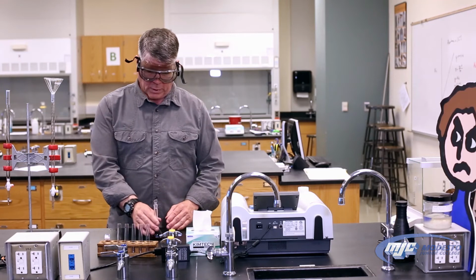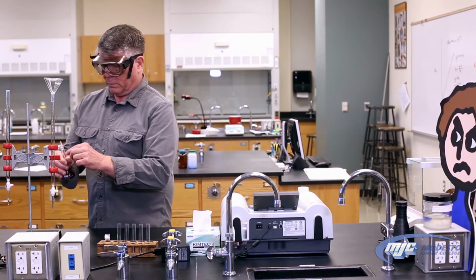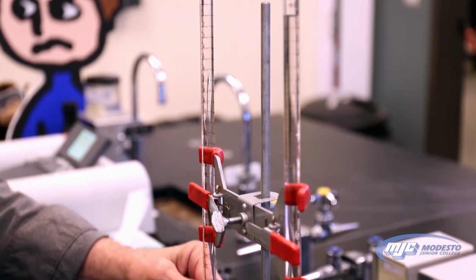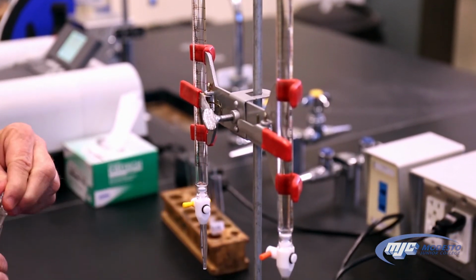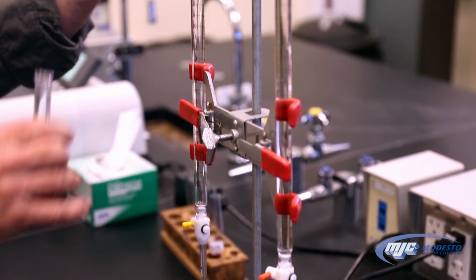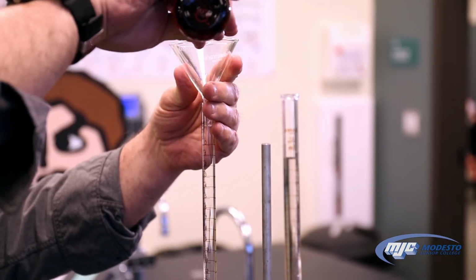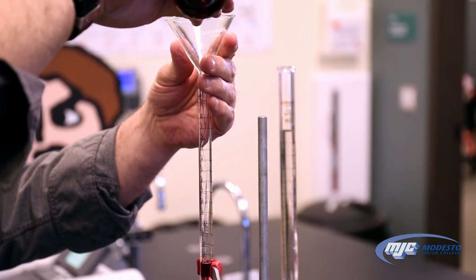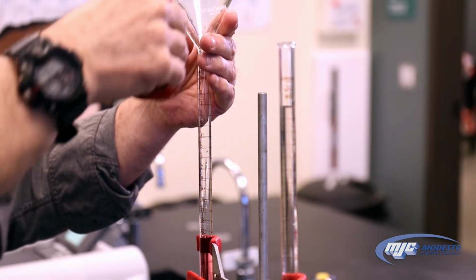So that's good. I'm going to add some stock solution to this burette. The stopcock has to be closed, which is perpendicular. Otherwise, it'll just go right through. Pour it in, and I'm going to fill it up past the zero, past the top mark, and then we'll get the air bubbles out.